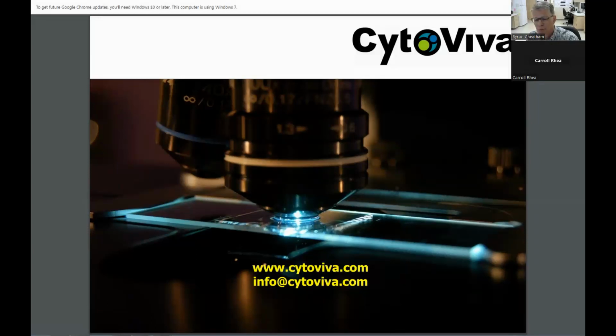But also, if I'm looking at, for example, trying to target nanoparticles to specific cells, there are targeting proteins and peptides that will allow a nanoparticle to be preferentially endocytosed or absorbed by a specific type of cell. And then sometimes that nanoparticle, depending on other functional groups, can go to specific areas of the cell, as I understand it. And the chemistry in that's, again, way above my pay grade.